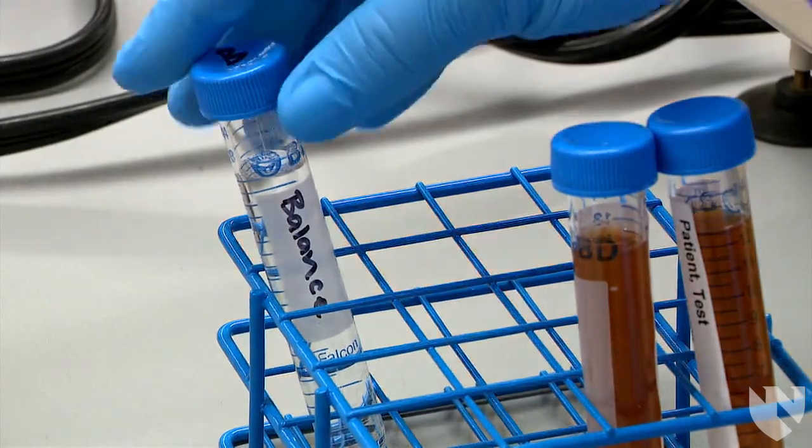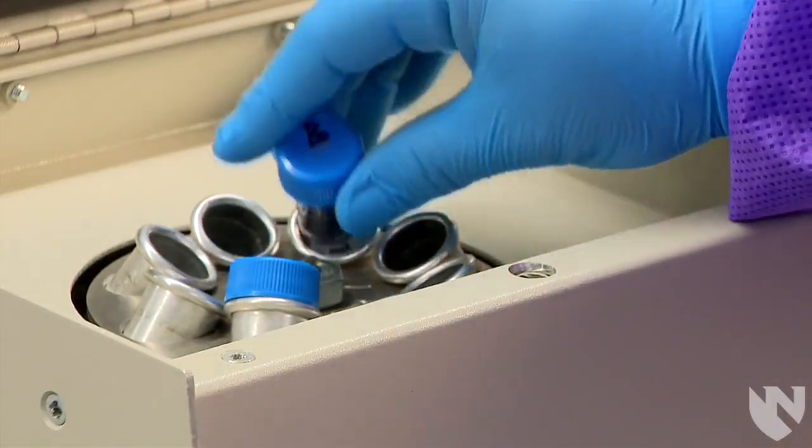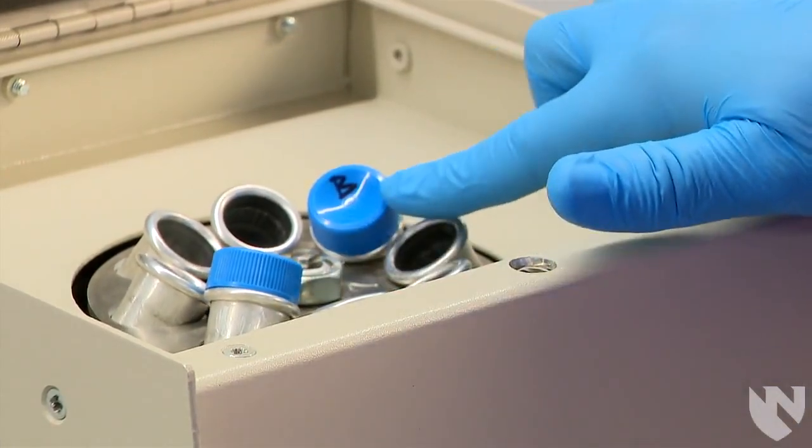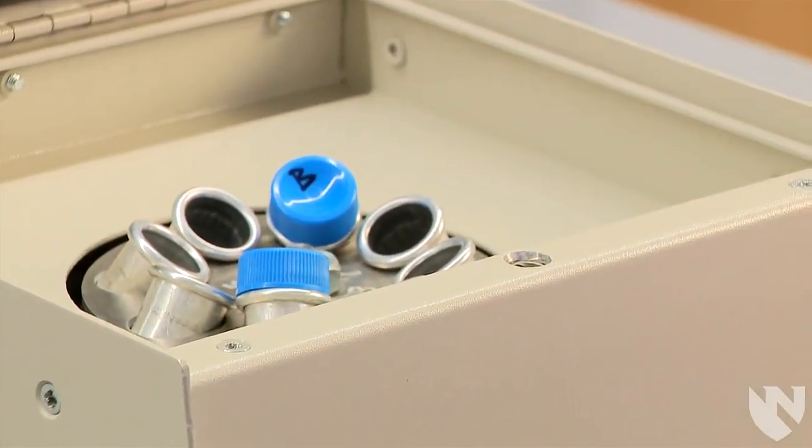Place another conical tube filled with the same volume of water, or another urine sample if you are spinning more than one urine sample at a time, on the opposite side of the centrifuge to balance it.